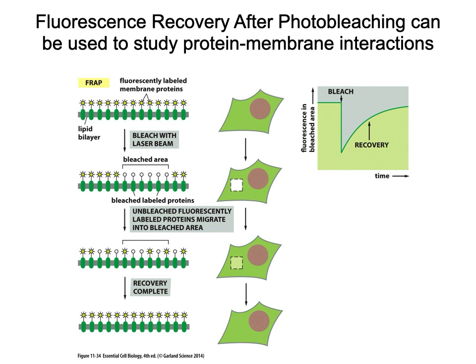What we have is like a clear window here, so you can see how there's no dye inside that area. After time, depending upon the protein, maybe the protein can dynamically move through the plasma membrane, and you'd get some recovery in that bleached area, because undamaged fluorescent proteins would come into the area and some of the damaged ones would leave that area.